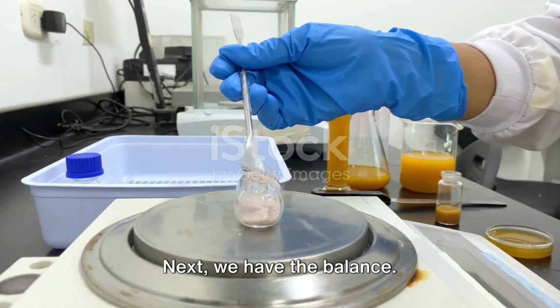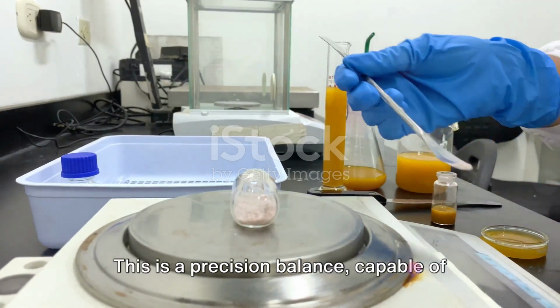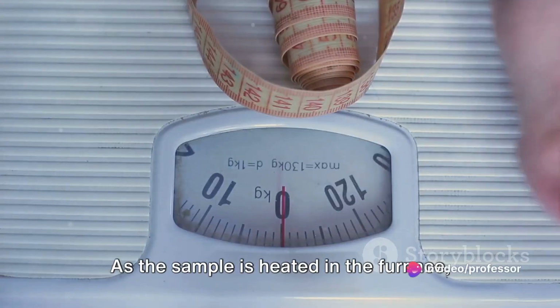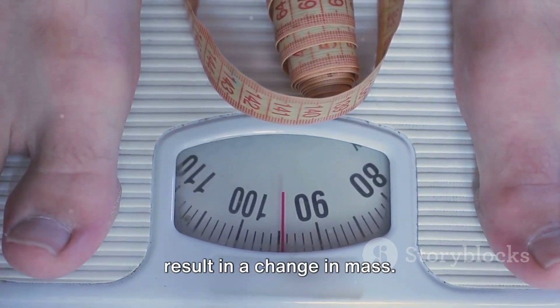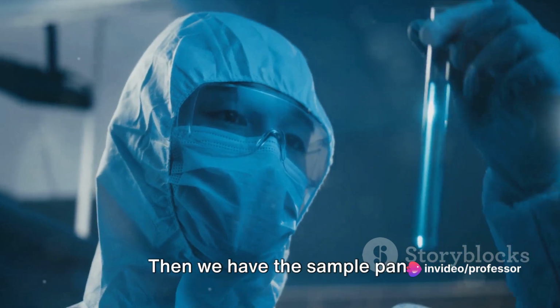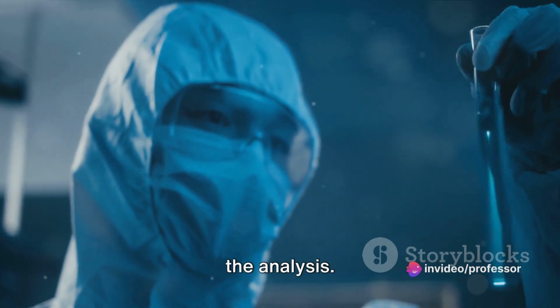Next, we have the balance. This isn't a balance you'd find in your kitchen or your bathroom. This is a precision balance, capable of measuring changes in mass down to the microgram. As the sample is heated in the furnace, it undergoes chemical reactions that often result in a change in mass. The balance detects these changes, allowing us to track the mass of the sample over time. Then we have the sample pan. This is where the sample resides during the analysis.